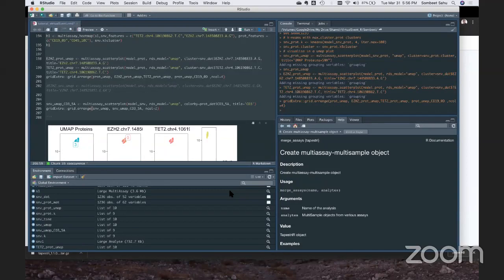How do you decide which normalization method to use when performing normalization of each data slot? For a protein dataset, usually we use CLR, which is centered log ratio. You divide the reads by a geometric mean. And for mutation, for read count data, we usually use median or mean for normalization.